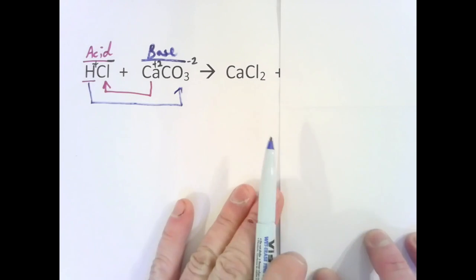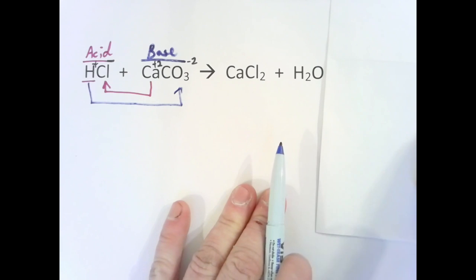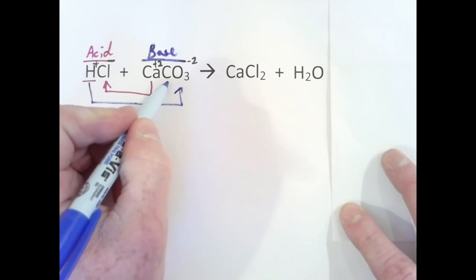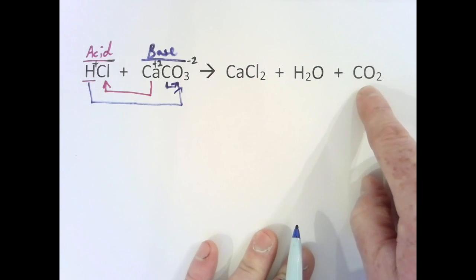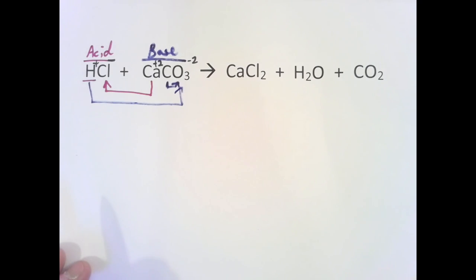And what we end up making is H2O. Now, there's one more thing that's going to be created in this reaction. We've got some carbon that will still stick with our oxygen, and what we've created are those bubbles. That's the CO2 that we saw effervescing from the reaction.